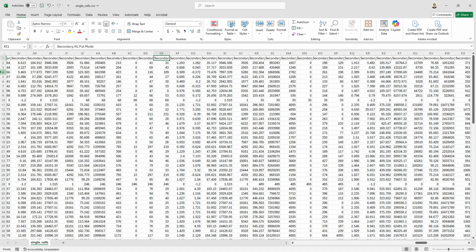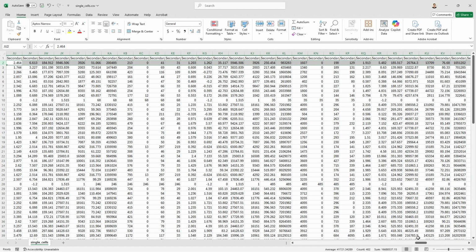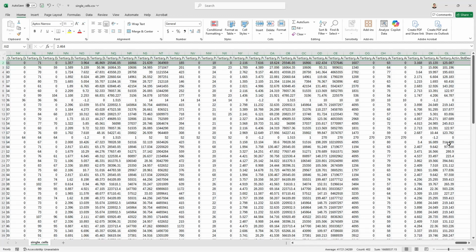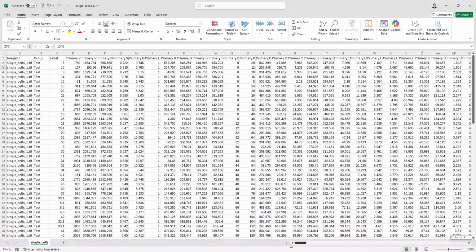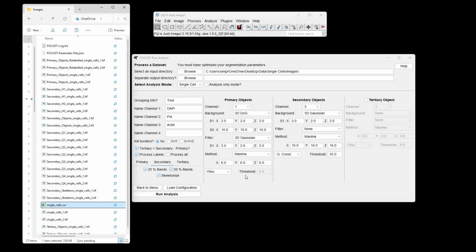So we store the skeleton data, the quartile data, and the half data for the shape, all in the same row. So it all pertains to the same cell. So we end up with a fair bit of information all the way over at OL in Excel. But it's then incredibly well positioned to go straight into either Excel or something like GraphPad, Python, or R, where you can then start to correlate and extract some really, really powerful insights on your 3D matched data. I will now, through the magic of editing, cut to some spheroid stuff to show you a proper interactive version of what that looks like.